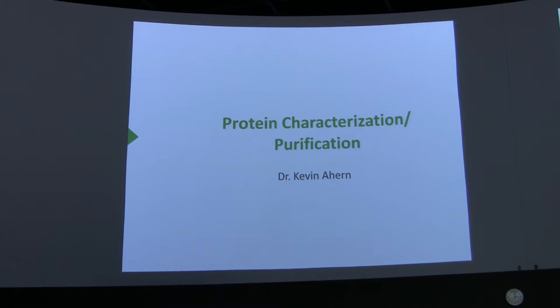Okay. Let's talk about protein purification, characterization. One of the things that we have learned is something about structure of proteins, and we've spent a fair amount of time talking about charges of amino acids in proteins. And in your recitations, you either have been or will be doing that as well. So hopefully you're getting on top of the significance of that. We can use our knowledge of the chemistry of proteins as a means of purifying them. Now, some of the things I'll talk about here today apply to things besides proteins, but proteins are probably the best example that we can think of for these purification techniques.